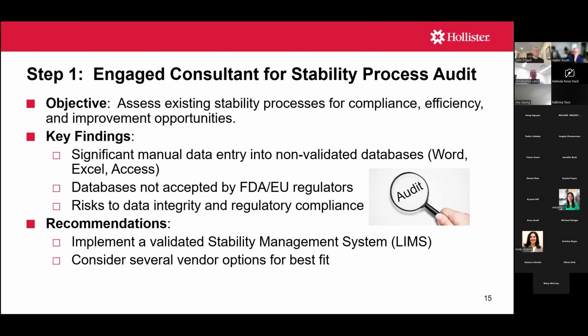And in the end, his big recommendation was, we were at a severe compliance risk just because we had all this manual data in these databases, Excel spreadsheets, Access, and so forth, that weren't validated. So, with the regulatory agencies such as FDA as well as EU, it puts you at a compliance risk.